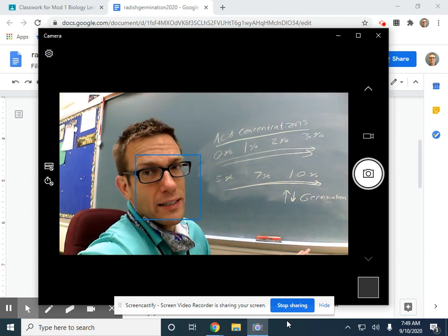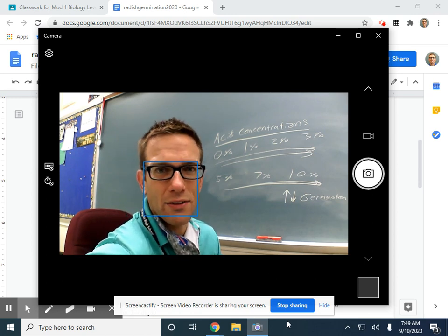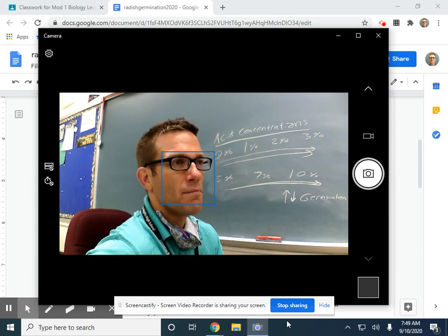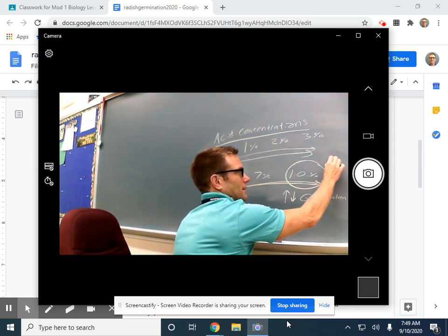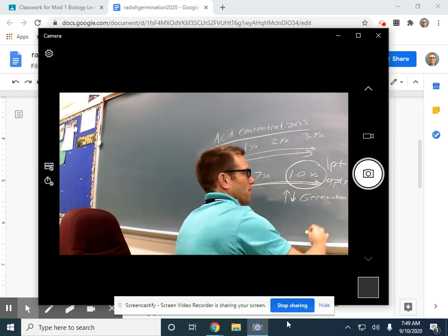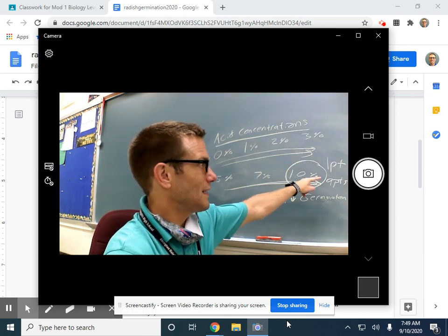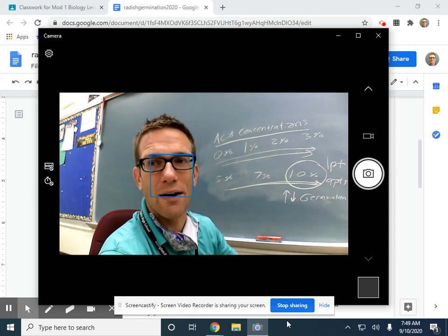Maybe you think that vinegar, you could drink vinegar. You're not going to drink that vinegar I gave you, but you could put vinegar in salad dressing. You can put it on French fries and things. You make pickles with it. Maybe you think taking vinegar and mixing 1 part vinegar with 9 parts water, that's really watered down vinegar. Maybe you think this isn't going to have an effect at all. Everything's going to grow, because that's hardly anything, taking vinegar from Garrity's and diluting it down that much.